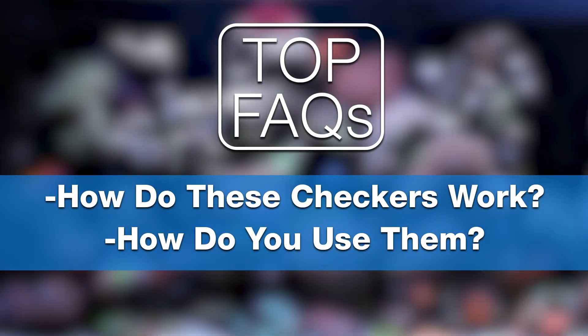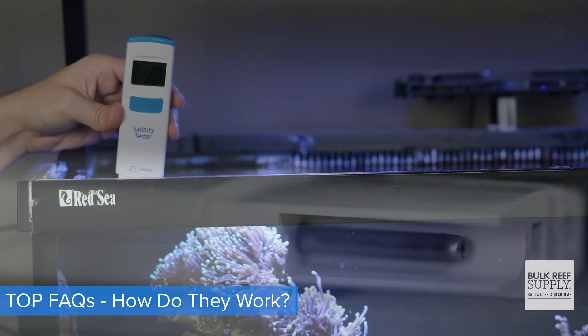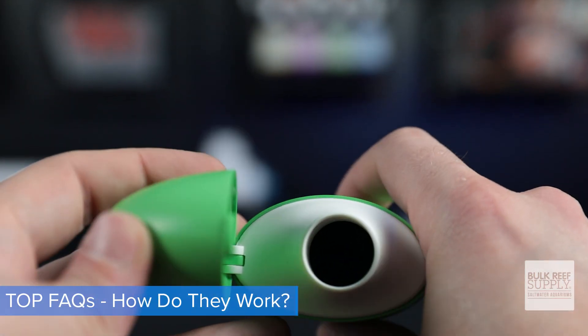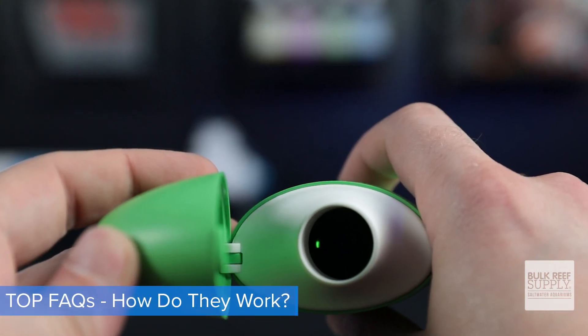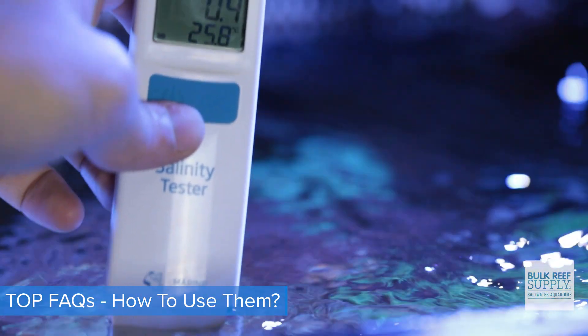So how do these checkers actually work and how do you use them? Other than the salinity tester, which uses electric conductivity to measure salinity, the Hanna testers are colorimeters, meaning they use light to compare colors to get readings. And here's how to use them. For the salinity pen, you just turn it on, dip it, and read it. As for the Hanna checkers, they all basically work the same way.